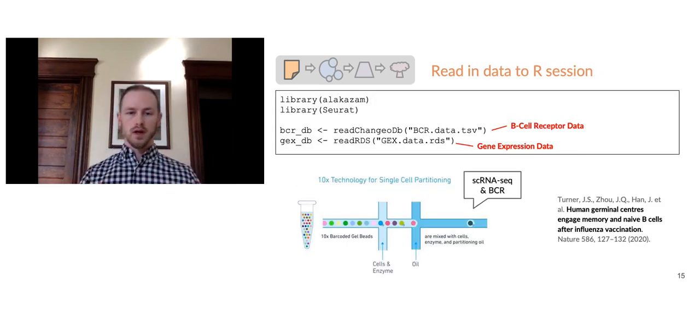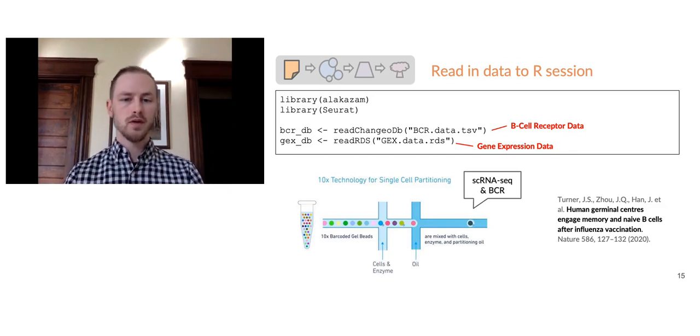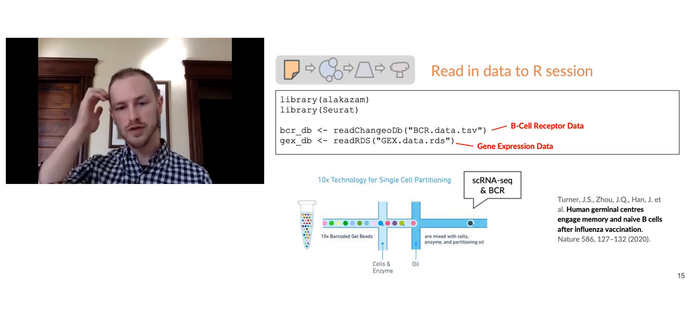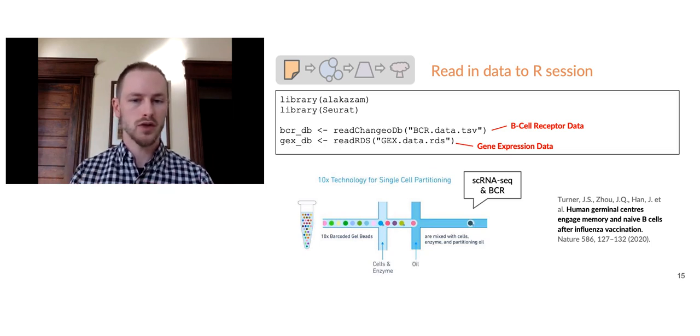So let's get started with the actual tutorial. First of all, everything in this tutorial is going to happen in the directory of the example data that we sent out earlier. So if you want to follow along, be sure that's unpacked and move inside of it. If you have the Jupyter notebook, then it should all be loaded.